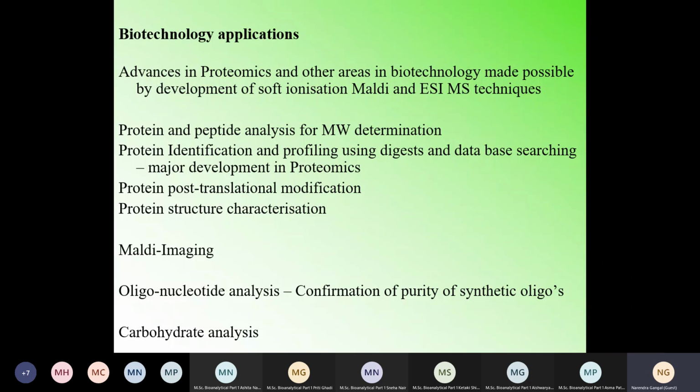There will be a supersonic expansion of the plume of the matrix, and because of this expansion, it takes the sample molecules into the vacuum space. Then there is a transfer of a proton from my matrix to my compound of interest.